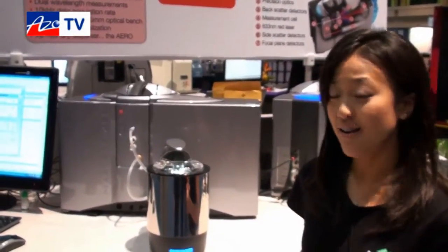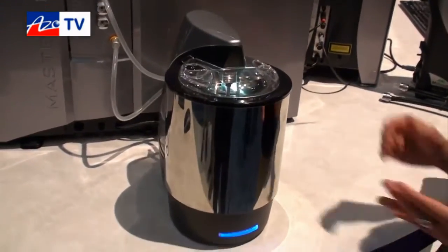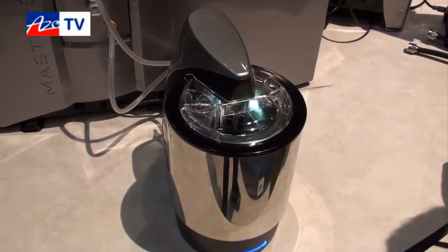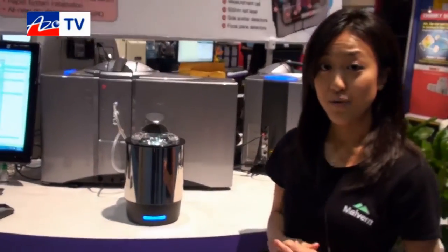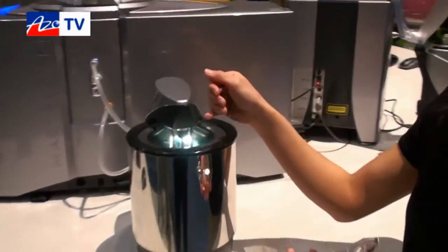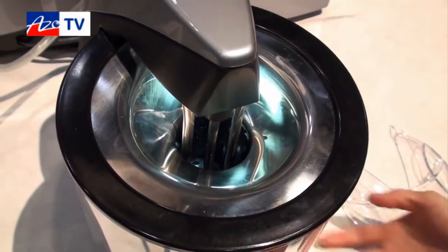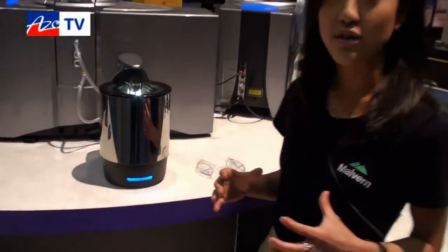For wet applications, this is our wet dispersion unit and you have three different options. The first is the medium volume, what we call the Hydro-MV, which is what's in front of you right now. We also have a large volume called the Hydro-LV, and an EV option that lets you exchange beakers flexibly according to your application. Inside the Hydro-MV we have a stirrer, a centrifugal pump, and 35 watts of inline sonication at the bottom of the disperser, allowing you to efficiently disperse your samples.